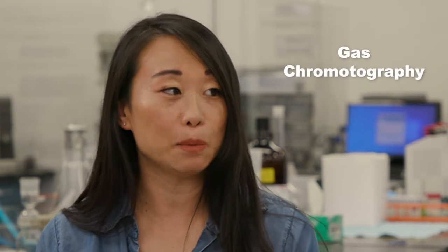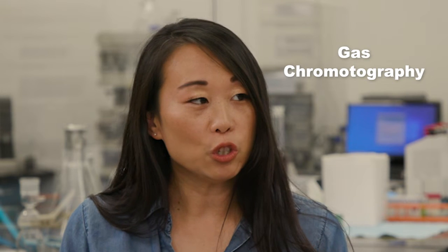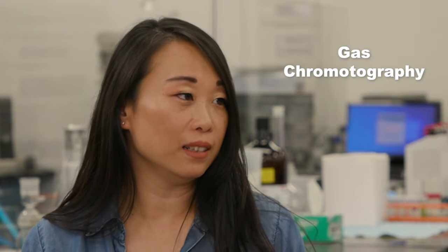What we do here is use something called GC, gas chromatography, with headspace. Headspace is the part of the instrument that introduces your sample to the GC. That's usually used for volatile substances like hexane, ethanol, and methanol, as with hand sanitizers. You've heard there's a limit of methanol in hand sanitizers.